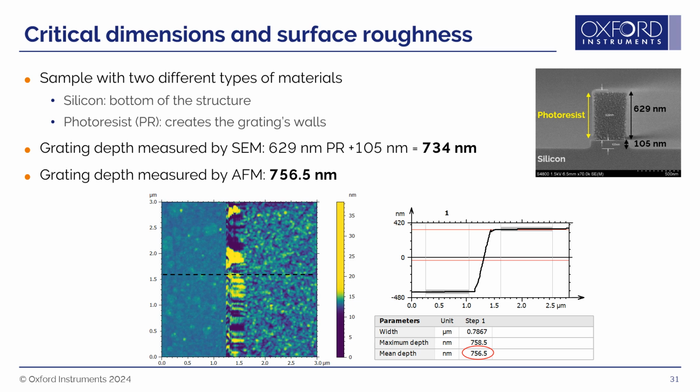When assessing sample roughness, tip sharpness is the key tip property to consider. It is often defined as tip radius, meaning the smaller the radius, the sharper the probe. Since we are not constrained here by narrow trenches, we used an Olympus AC55 probe, which has a small tip radius of about 5 nanometers, but a large half-cone angle.